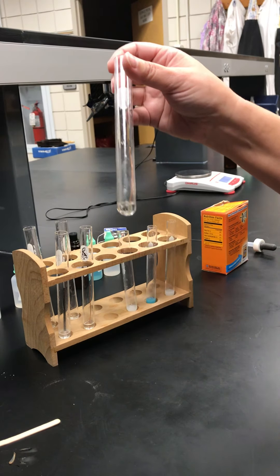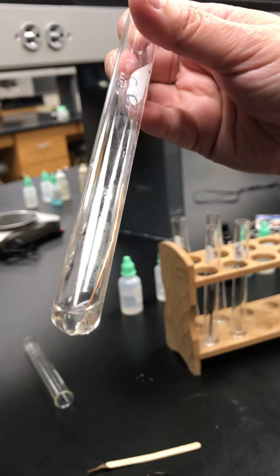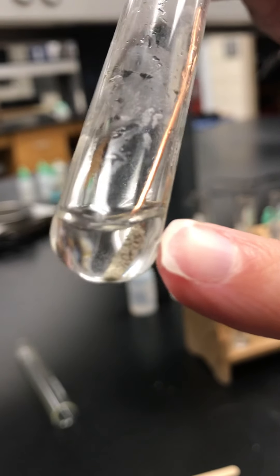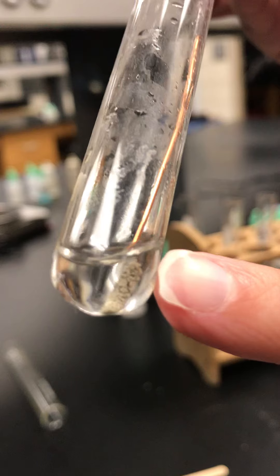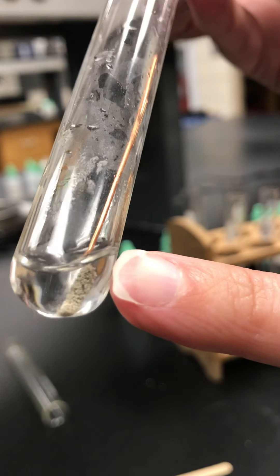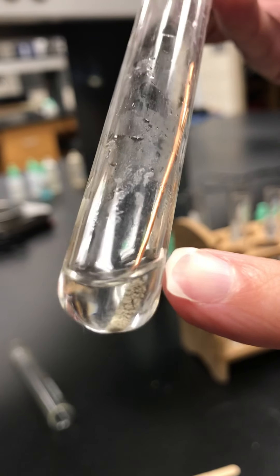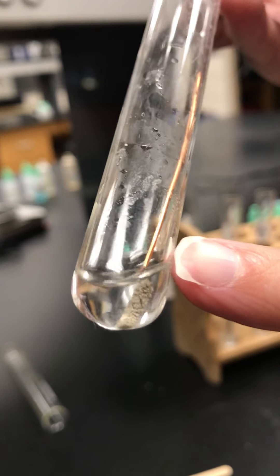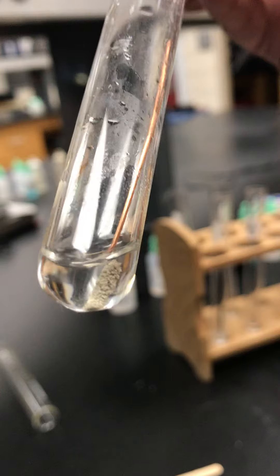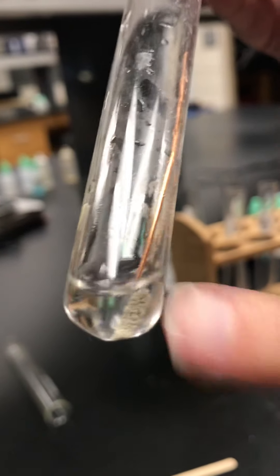Going back to that silver nitrate where we put the copper wire in it — you should be able to see at the very bottom that the copper wire looks like it has some gray stuff on it. There's some solid accumulating on it, and that's actually silver from this solution. The silver nitrate had silver in solution that is now depositing itself on the wire. That is a chemical reaction — a solid is being produced.